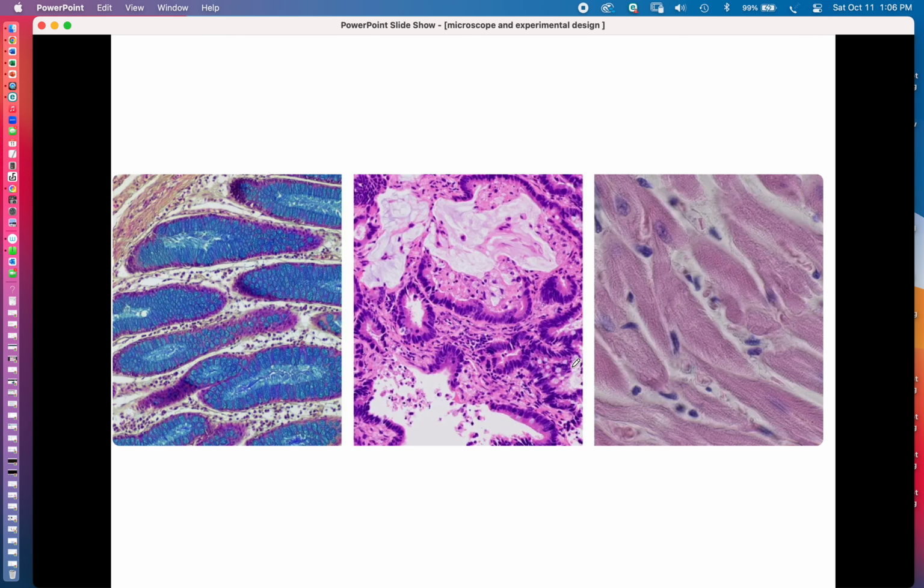Okay? And here's some examples of bright field. And these are samples that have been stained, and they've been stained with different dyes. And they're visible dyes, they're pigments. One good way to think about this is that in, let's say, the mid-1800s, chemists made some really strong progress in chemistry by identifying and starting to synthesize pigments that can be used as dyes in clothing. And some of those same dyes could also stain samples for microscopes. And so they improve the quality of seeing cells in the microscope.